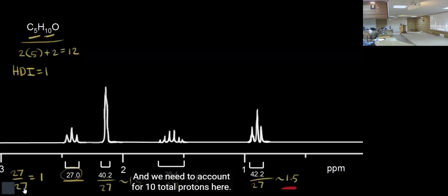I'm answering the question that you might have, if no one-proton signal exists in your mind, that can be, but in natural products it's very, very rare. Most often in natural product chemistry, we have one proton, and almost like all small molecules, we can identify one proton. And all these integrations depend on your identification that you consider that one as a one-proton signal. And then everything follows.